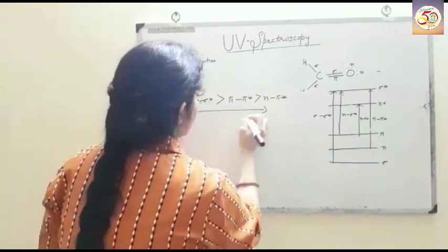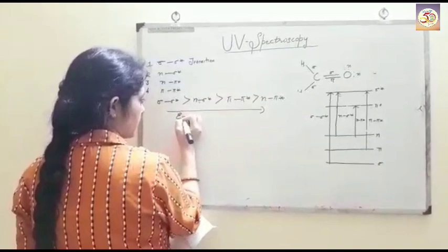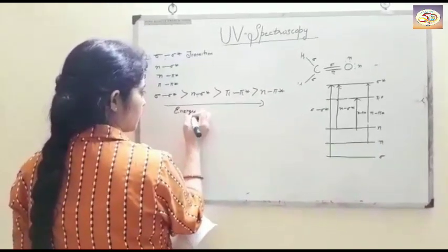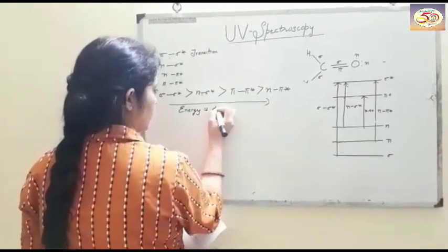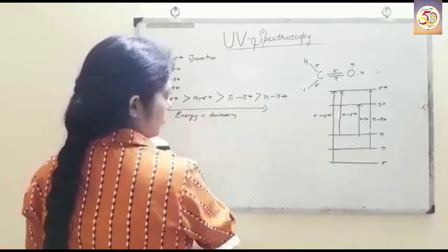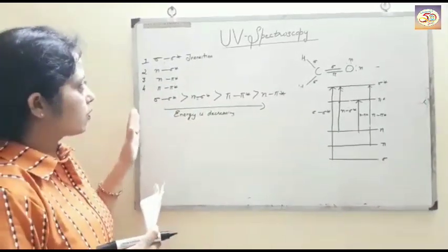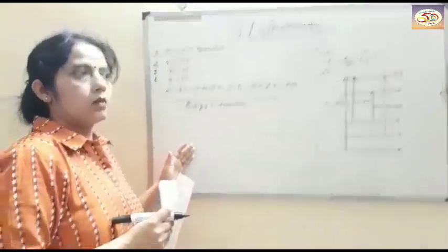When we move in this order, the energy is decreasing. The details of these four transitions we will discuss in the next section.